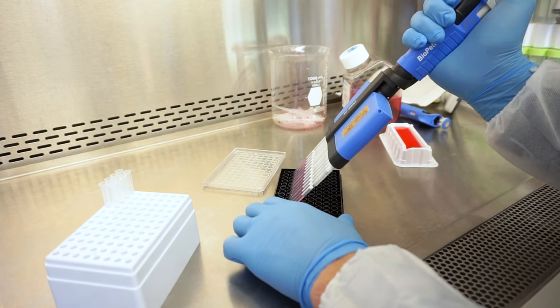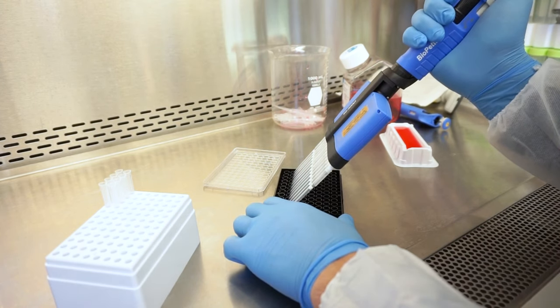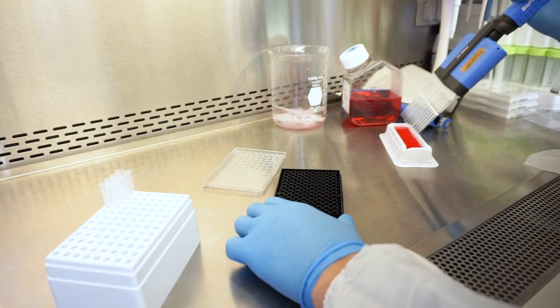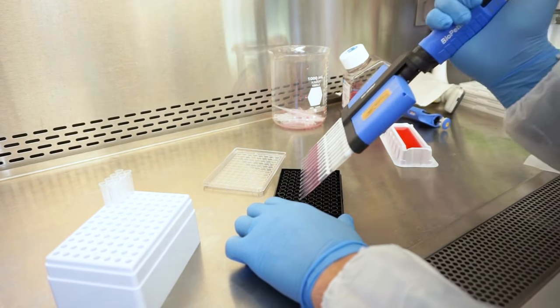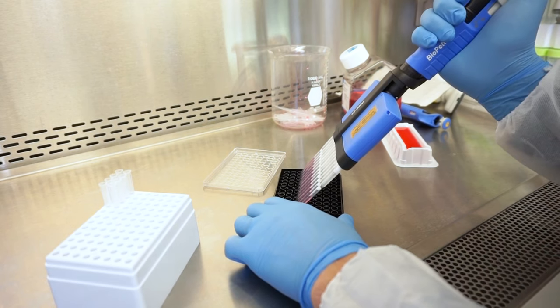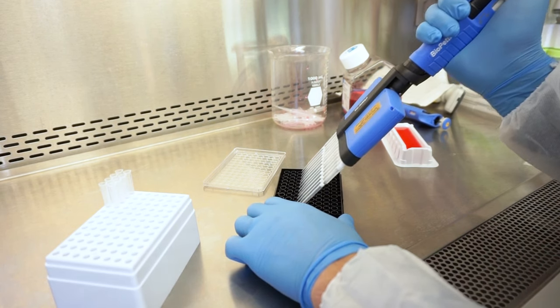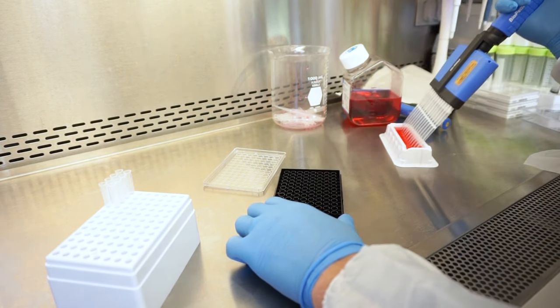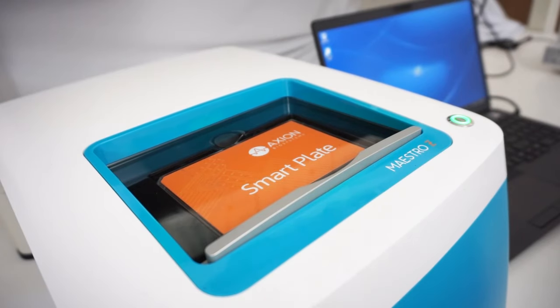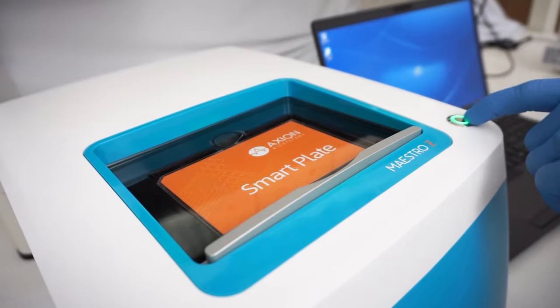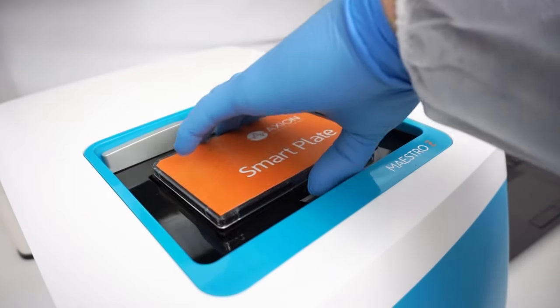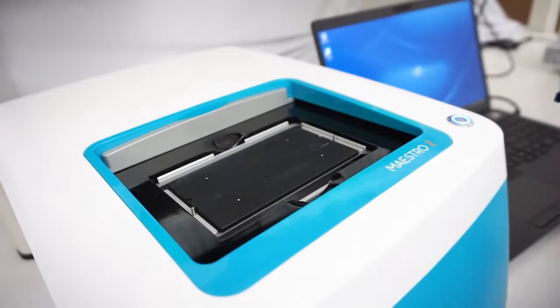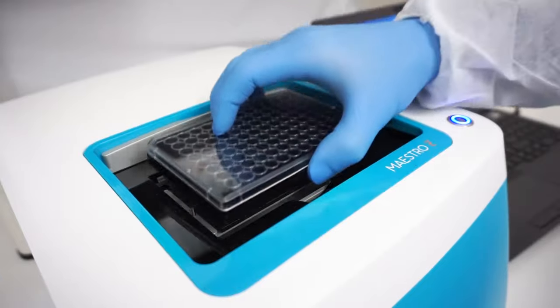For this experiment, we are plating A549 lung cancer cells so we can see how they respond to chemotherapy compounds. After plating the cells, simply push the button to open the recording chamber. Put your plate in and push the button again to close the chamber.